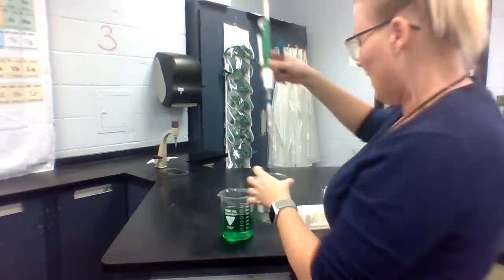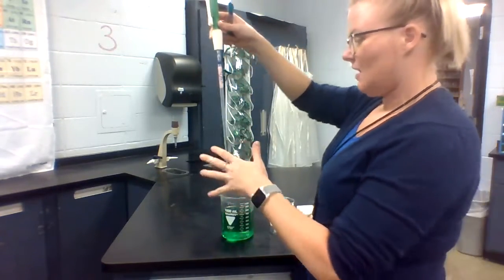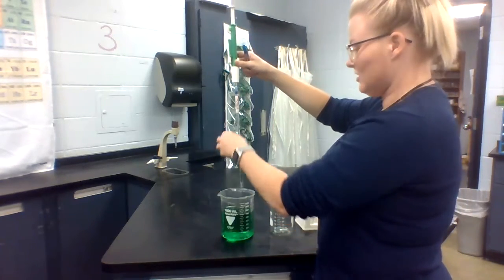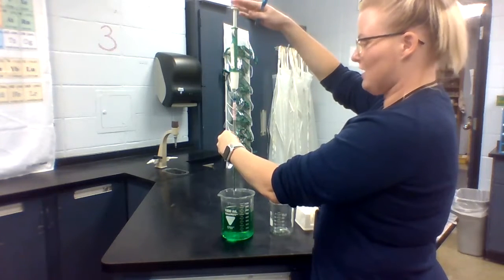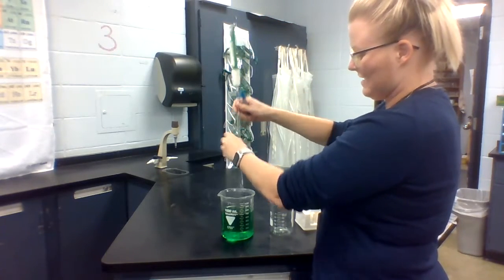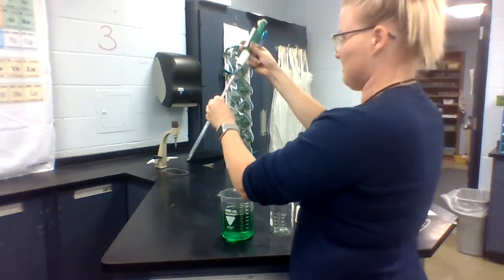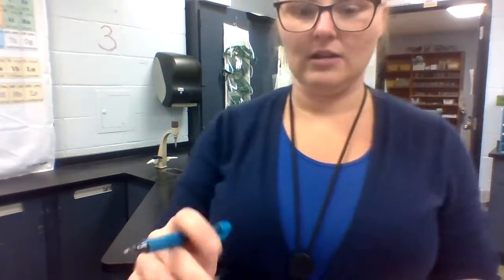Those two values are going to allow me to calculate how much I've actually dispensed. Since I'm done with this, I'm going to go ahead and dispense the remaining liquid back into the reaction container. To do that quickly, I'm just going to push down on this rolling lever — you'll notice that gets rid of almost all of the liquid in there. Then I'll just take that off and set it down. Okay, let's talk about calculations.